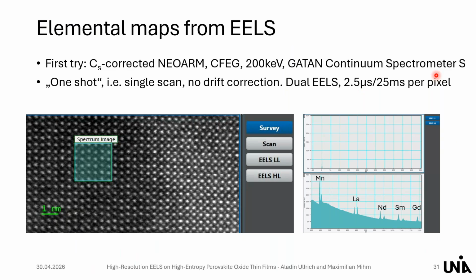And I guess maybe it's important or not. It's a, let's say, modified version, so the scintillator is capable of counting electrons, collecting electrons from 30 kV up to 200 kV. So it's not the standard one, but a little bit modified for us for low kV options. But we applied 200 kV beam energy here, so this doesn't matter actually. Yeah, great, thanks.